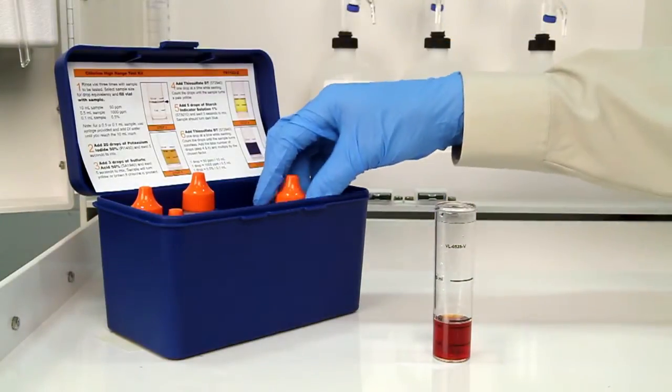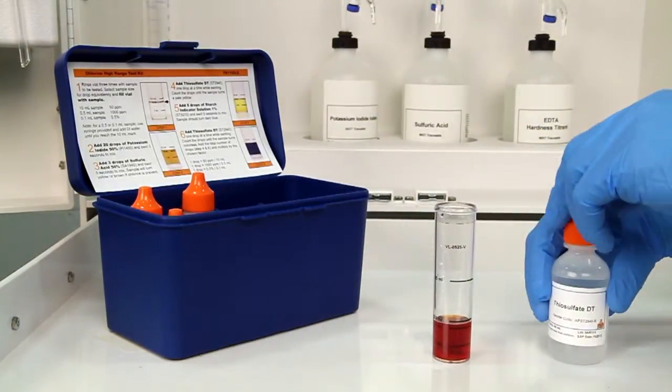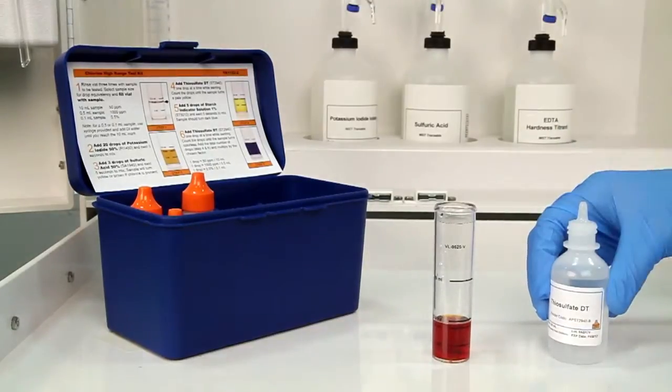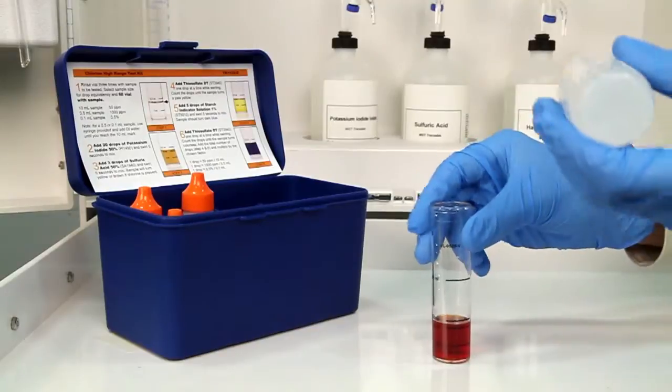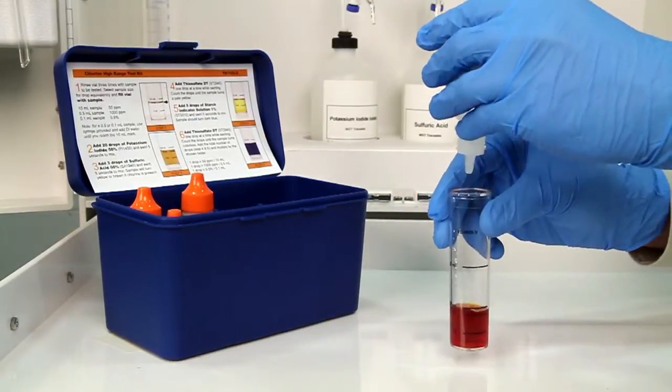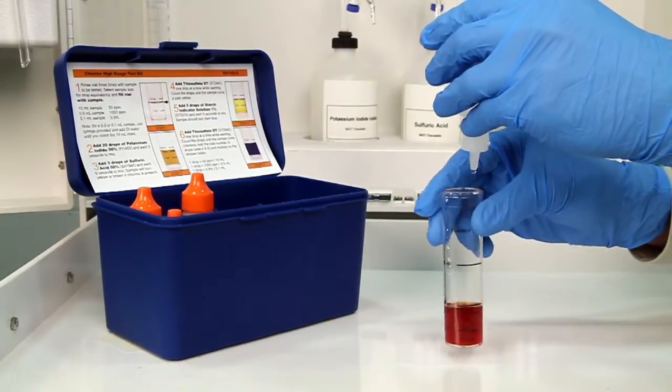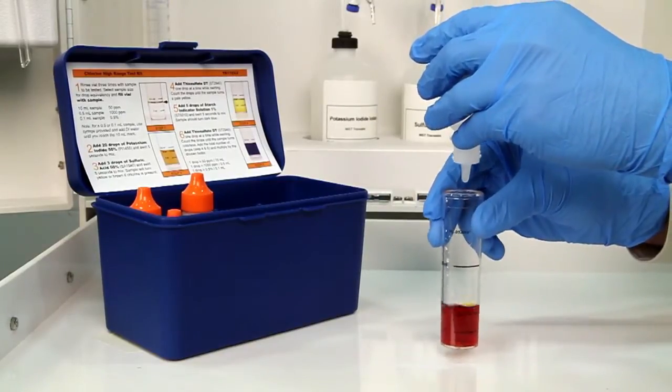The next step is to perform the first titration using thiosulfate DT. Each bottle of titrant is labeled with the equivalency and sample size it was manufactured for. It's important to make sure you have the proper titrant and the proper sample size for this titration.